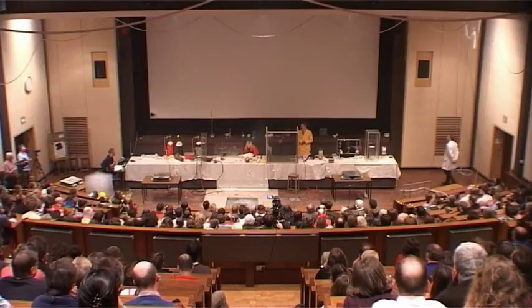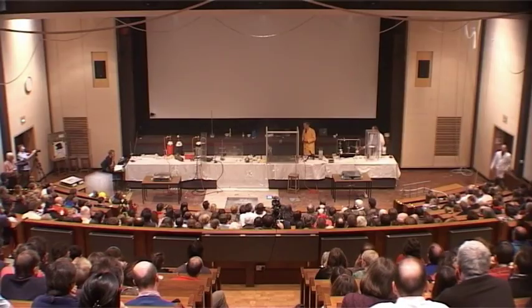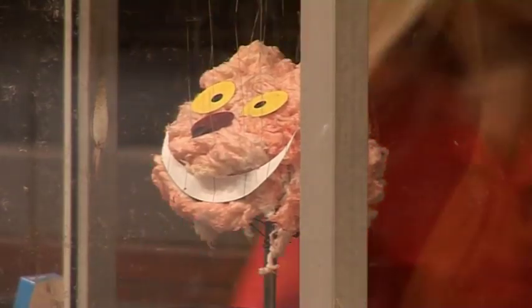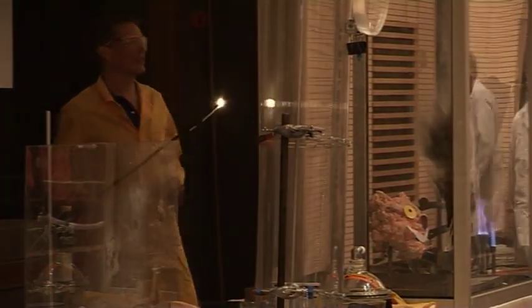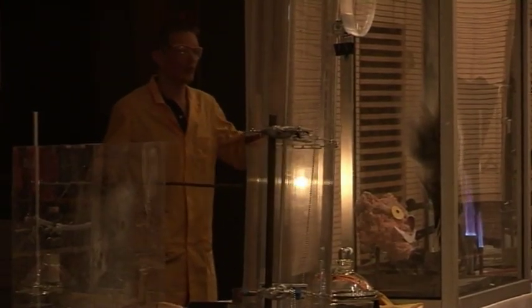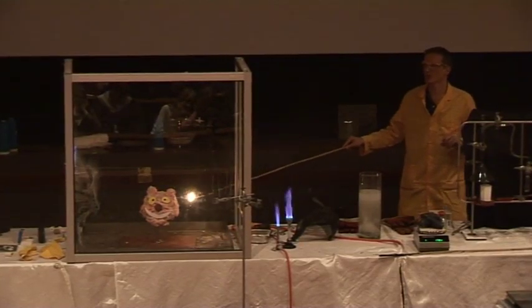So coming back to our cotton wool, you remember the cotton didn't burn terribly easily to start off with. We needed to supply some pure oxygen in order to get it to burn properly. Well, this time we've got some more cotton wool, and we've chemically modified it. We've built more oxygen into it. So this should burn. In case you didn't recognize it, it's clearly a Cheshire cat from Alice in Wonderland. So this now has cotton wool, but with the oxygen built in. So this is now nitrocellulose. We've nitrated this, and we should be able to see a nice reaction.